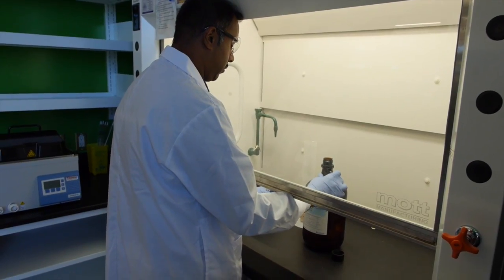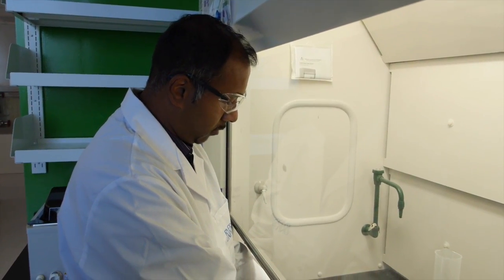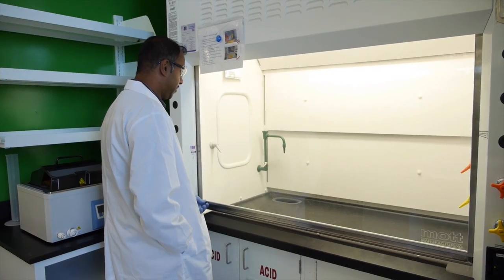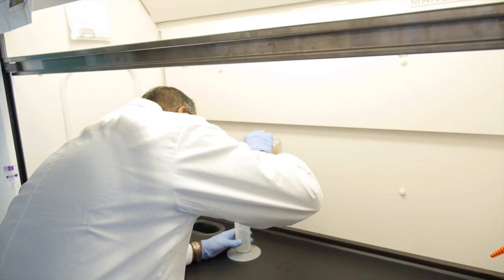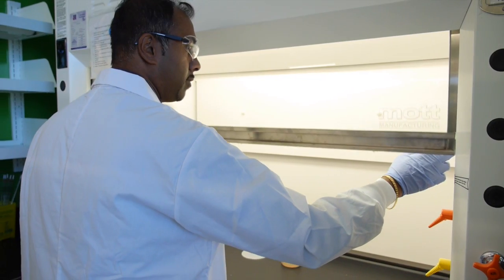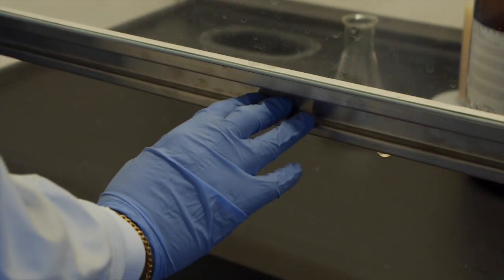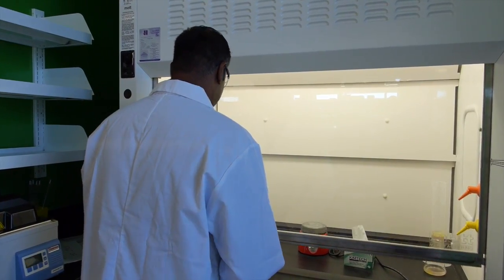Avoid making any rapid motions of the sash, body, arm, or hand, as well as having pedestrian traffic in front of the operating fume hood, as these will cause airflow disturbances, which can negatively affect the capture ability of the fume hood. Also, avoid placing your head or torso inside the fume hood enclosure. It's a good rule of thumb to keep your face at least 6 inches away from the sash. When you're not conducting any experiments inside the fume hood, keep the sash fully closed.